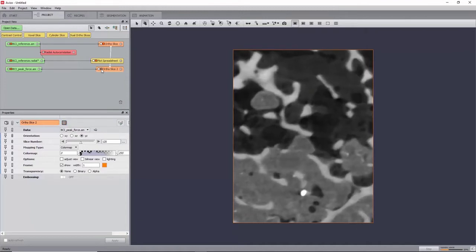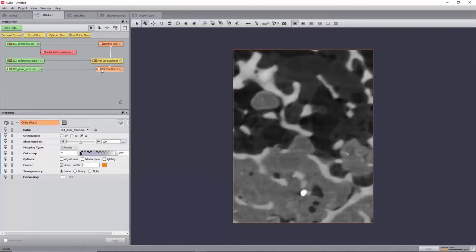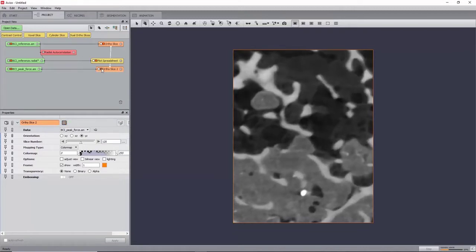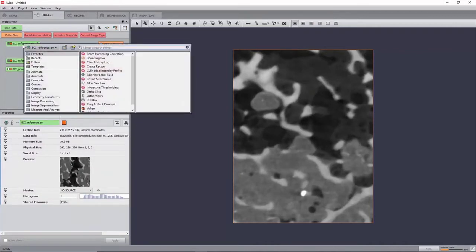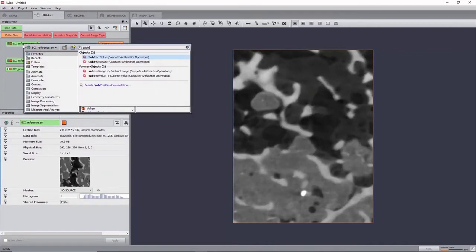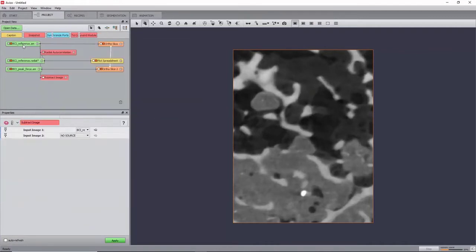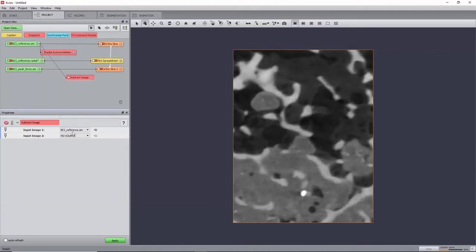In order to estimate the maximum displacement in this image, and because the images have been pre-aligned, we can just subtract one by the other using a subtract image module. Create it on the reference image, and select the deformed image as input 2. Now click Apply.